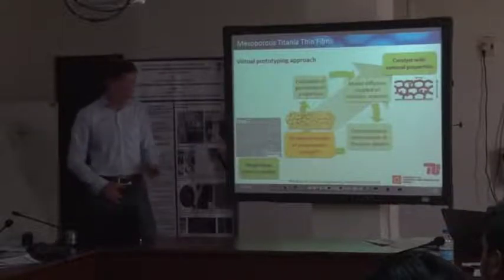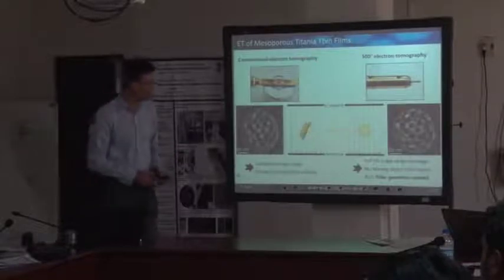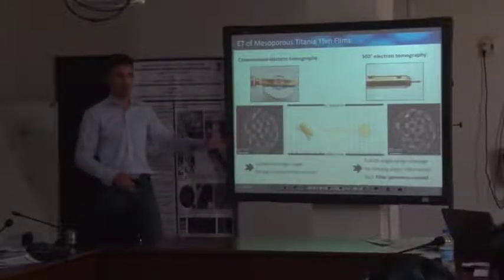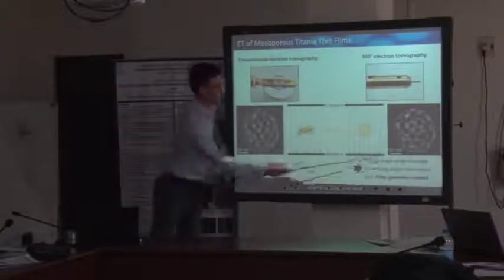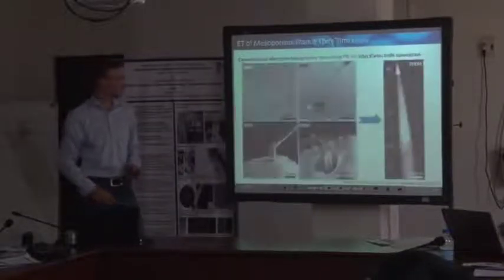It's not that you necessarily need the 360-degree tomography. But there are larger pores and very, very small pores embedded within the titanium oxide, which are not active during the catalytic reaction. In principle, the resolution here in 360-degree tomography is better. That is for sure.